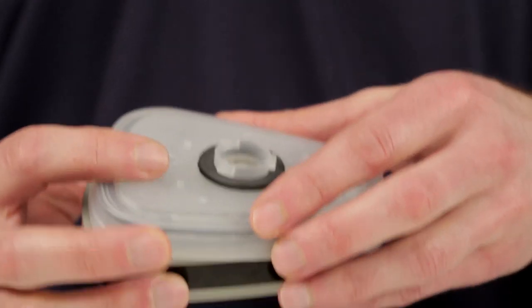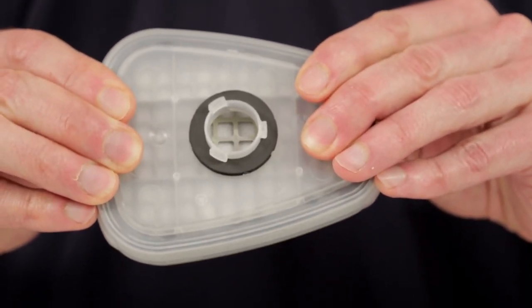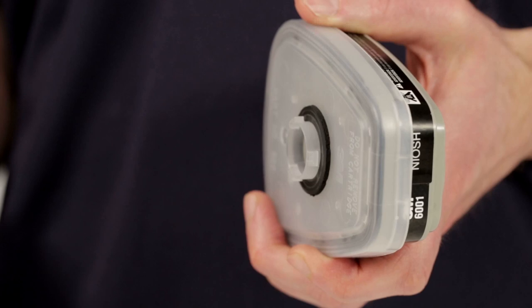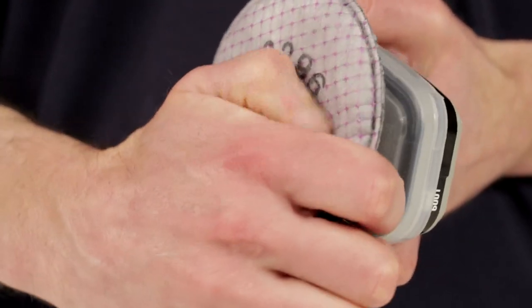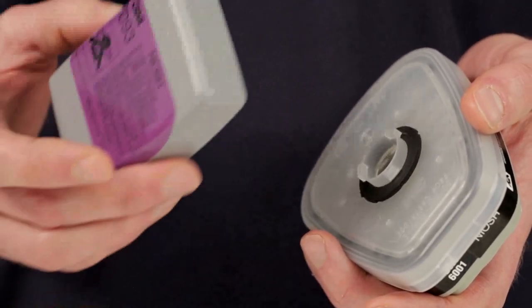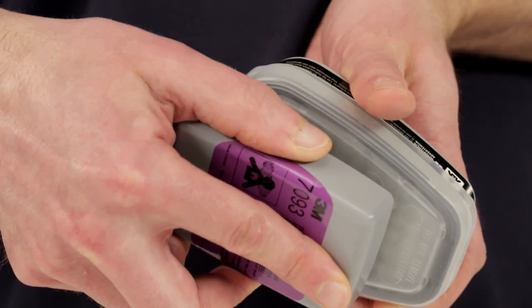To replace the filter, remove the retainer by lifting on the tab. To use bayonet attachment particulate filters on top of the cartridges, the 3M Adapter 502 is required. Align the adapter over the cartridge and engage the front snap and back snap by squeezing together — you should hear a click. The adapter is designed for one-time use only and should not be removed and reattached. Align the filter opening with the adapter and turn clockwise until it stops, ensuring it is firmly seated on the adapter gasket. These steps apply to round 2000, 2200 series, or rectangular 7000 series filters, which are removed by turning counter-clockwise.